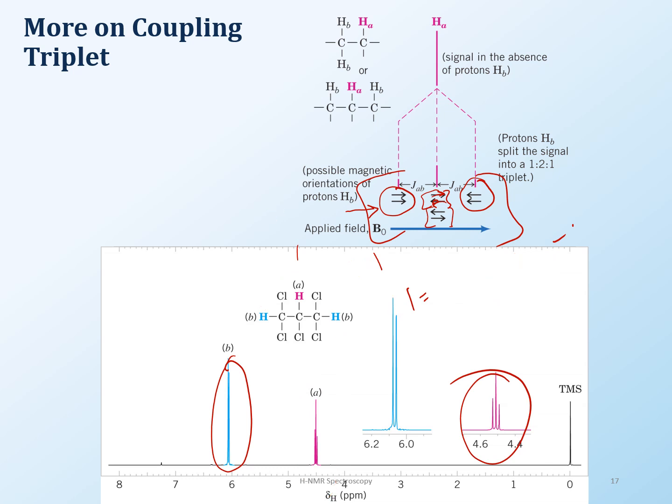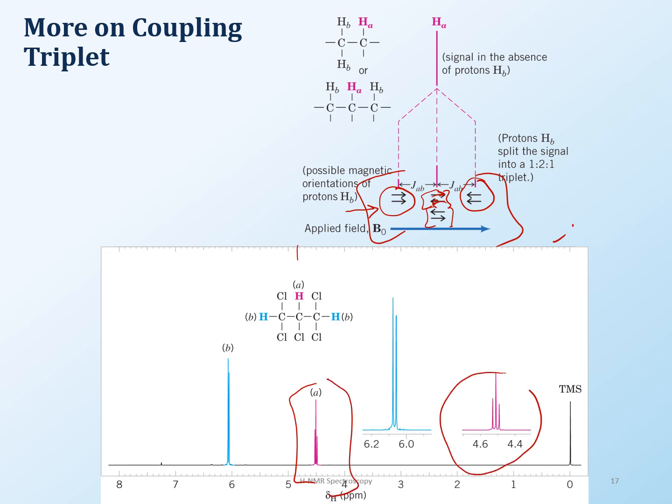Now, sometimes in NMR spectra you have to expand your NMR. So here what you do is you take the peak, you slice it out of the NMR, and then you blow it up, and then you paste it on there. This is another one of those workups that you have to do. So now you can clearly see the triplet and you can see the doublet.